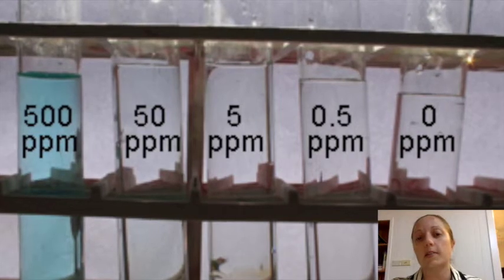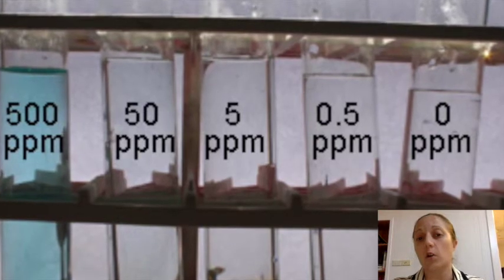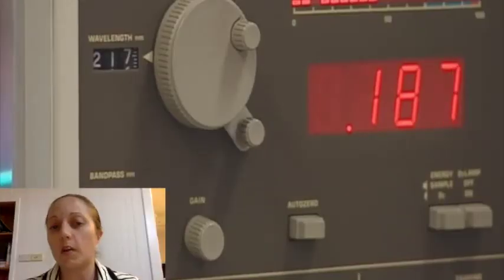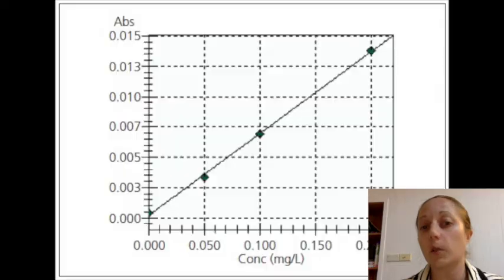So the higher the concentration of lead atoms in a sample, the more absorbance we are going to have. To do this, we would create a series of standard solutions. Those standard solutions would have a known concentration, and we would have increasing concentration of those standard solutions. We would then be able to measure the absorbance and create a calibration curve. And from that calibration curve, we could then measure a sample that we have collected, so an unknown amount or concentration of lead. And we would then be able to measure the concentration of lead based on that calibration curve.